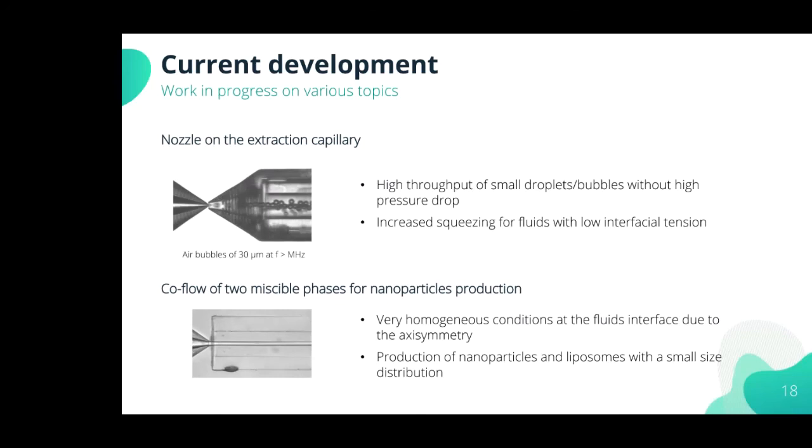What is the minimum volume of liquid sample needed to start forming micro droplets using the Raydrop technique? I'm asking this especially for expensive liquids. A few milliliters is okay, because to fill the chamber for the continuous phase, you need a few milliliters. But for the droplet phase, just 1 milliliter is okay to generate a lot of droplets, because one droplet is sub nanoliter. But you will need a bigger amount of liquid to fill the chamber and initiate your experiment.